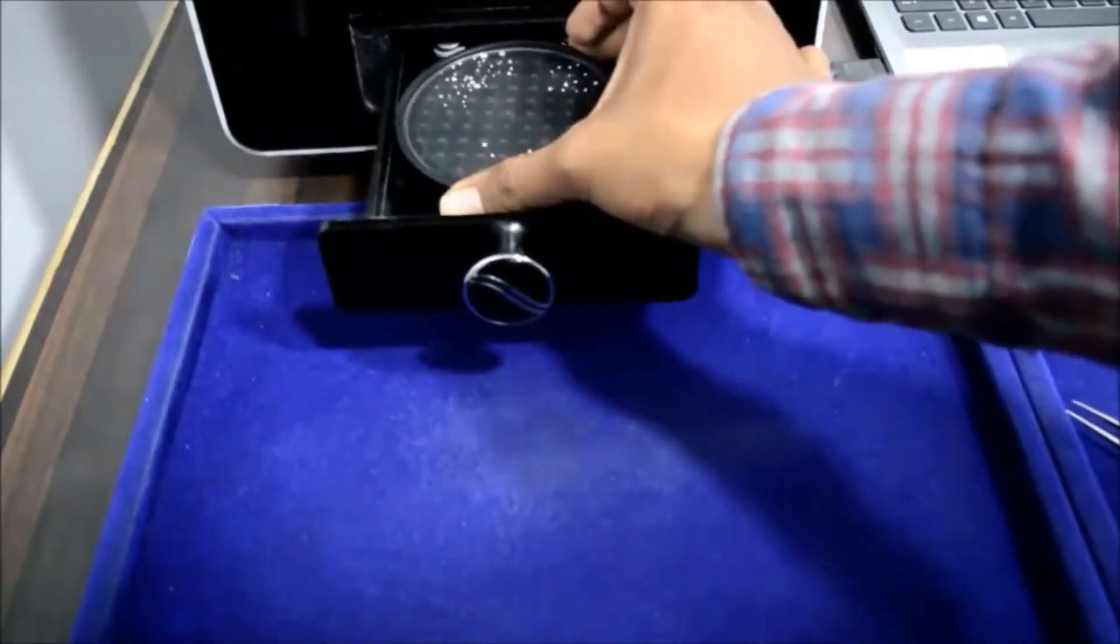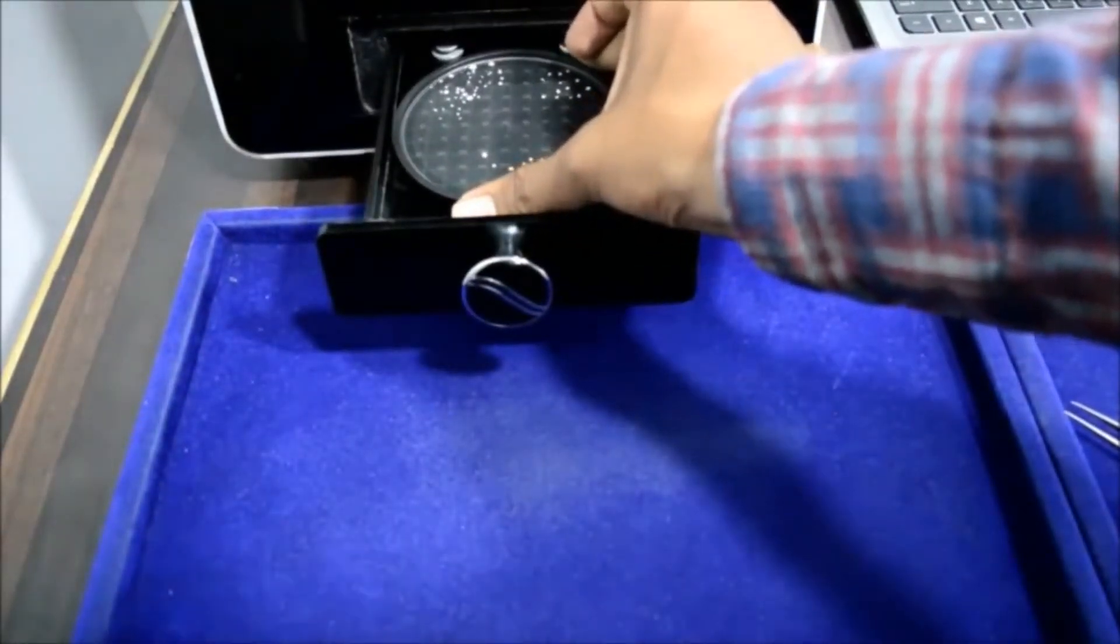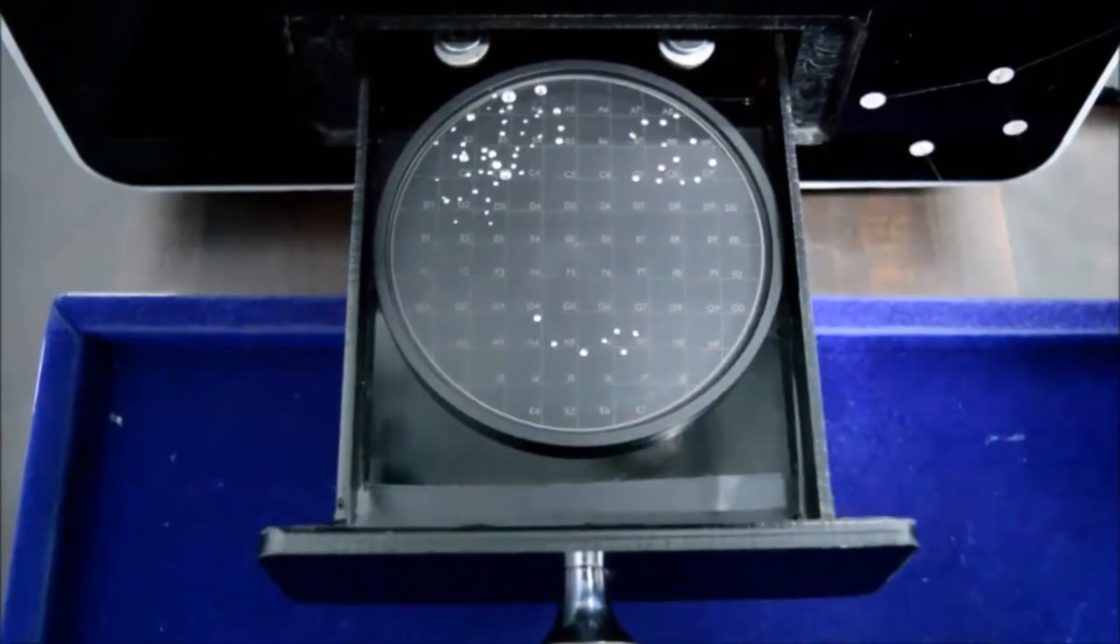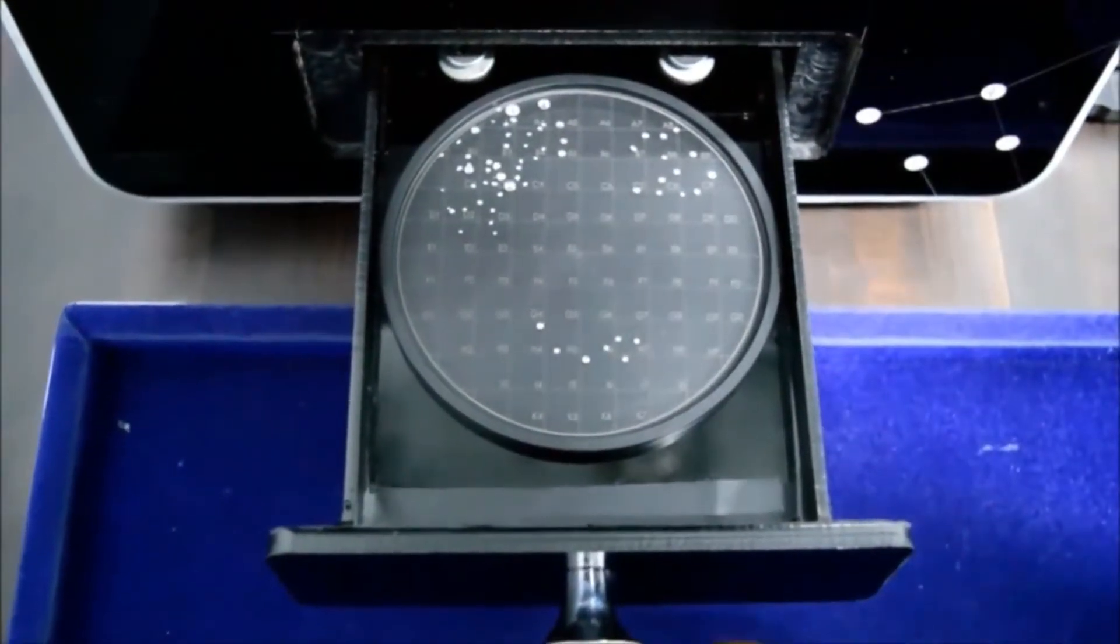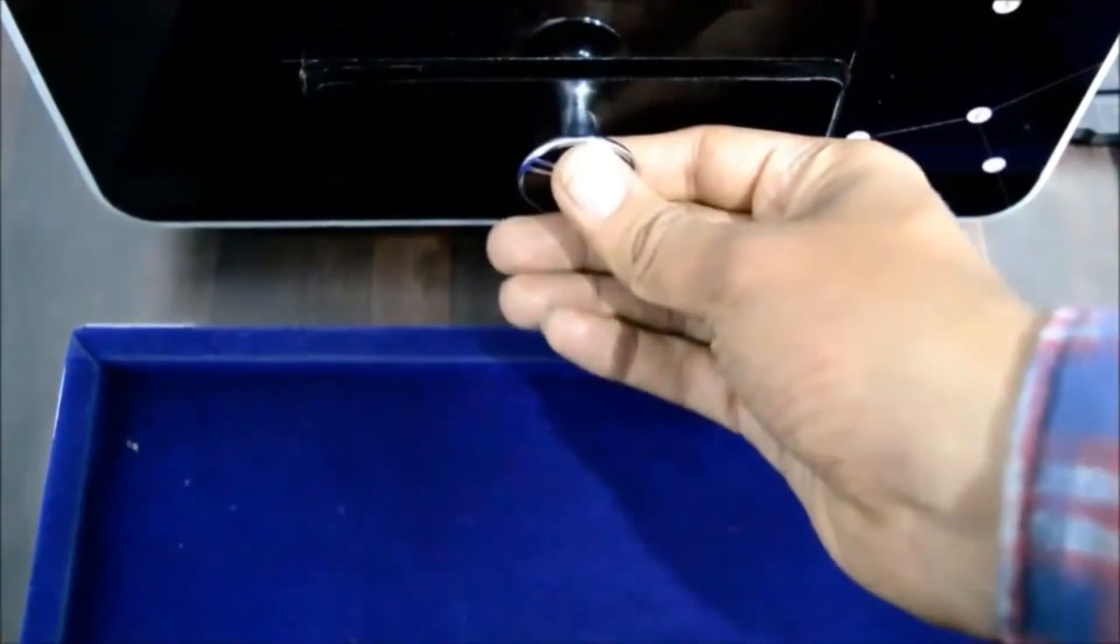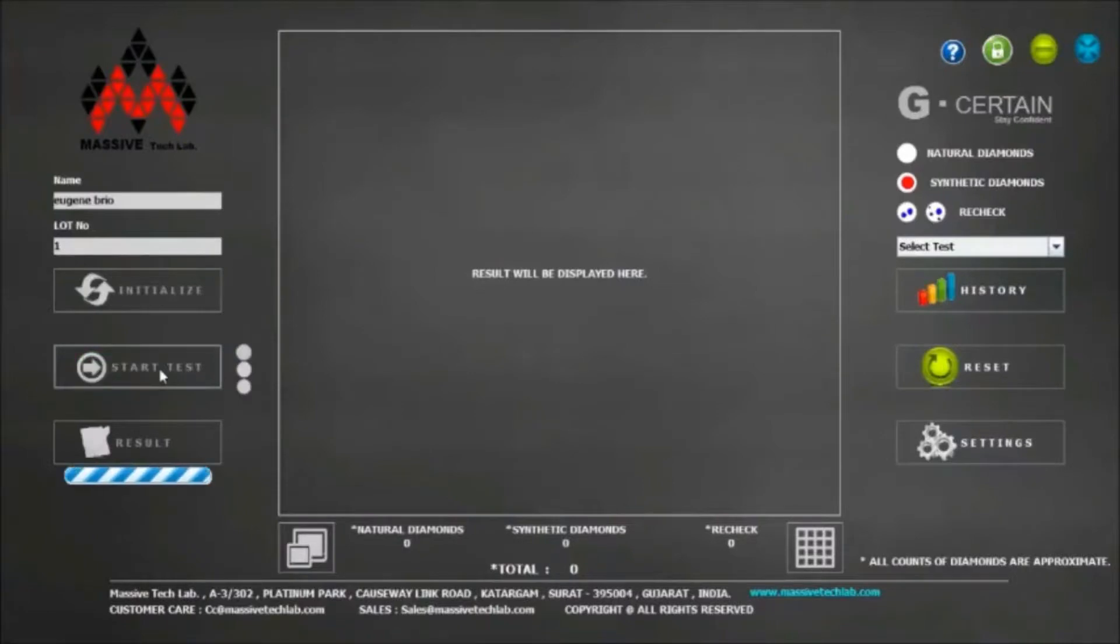Load the circular tray inside slider tray of G Certain. Make sure it is well located inside circular pocket given inside sliding tray. Click on start test button to start the test. Processing bar will appear below result button instantly after clicking on start test button.